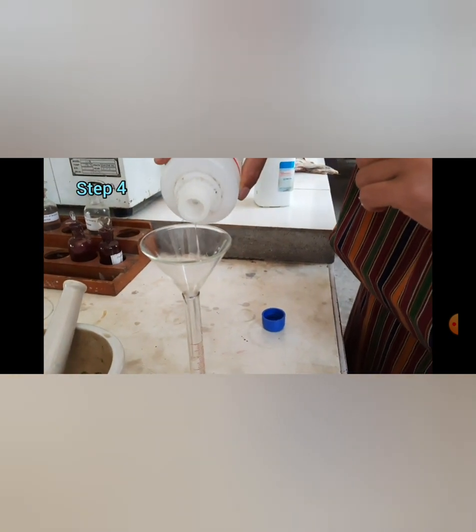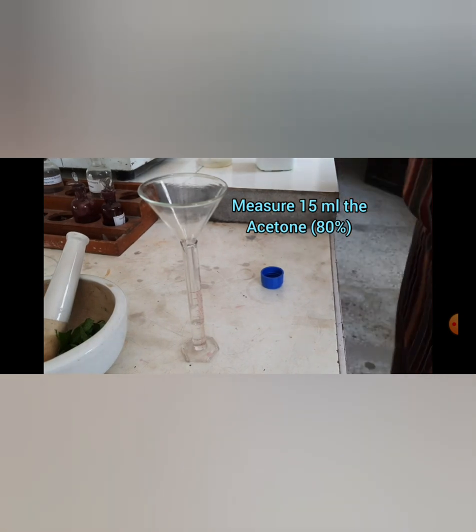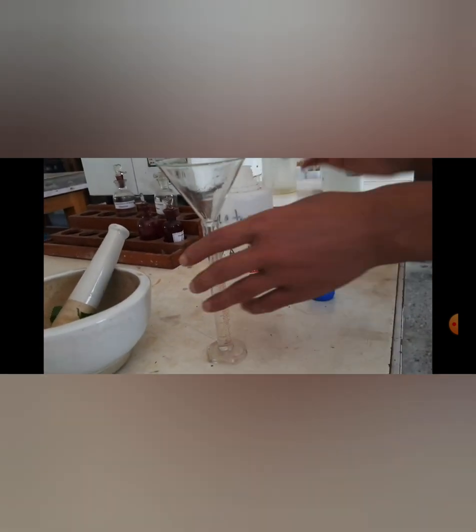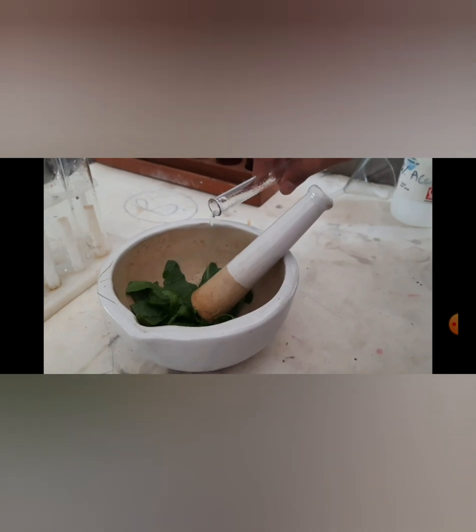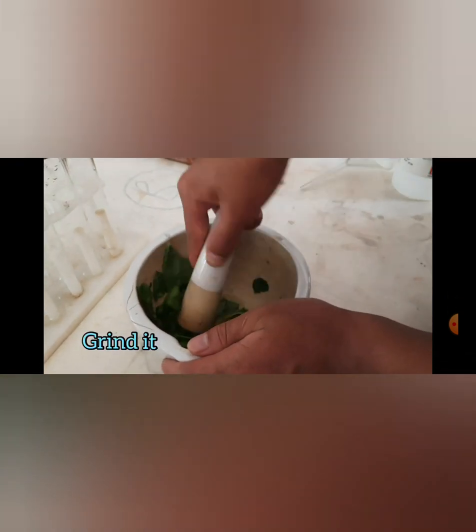Next, we put it in a mortar, then we have to measure 15 ml of acetone using a measuring cylinder. Then pour it into the mortar and grind it until we get a paste. The paste will look like this.